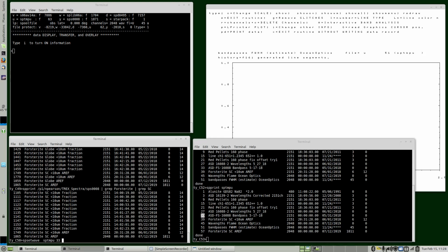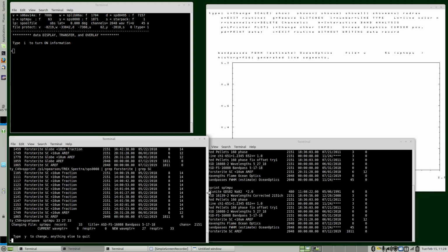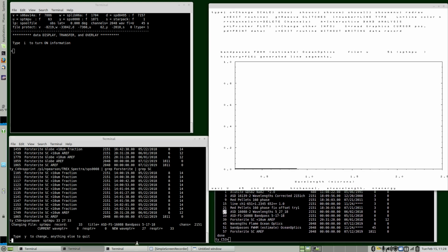Record 33, we're going to change that to 0.2, 27, and 33. Okay, and it'll tell us, let me expand our window here a little bit. It gives us the current and new.